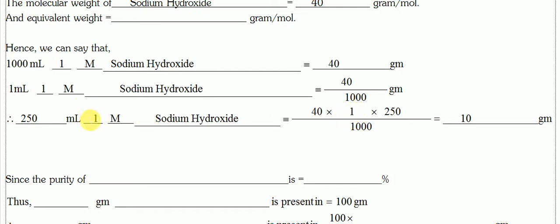If 1 molar or 1 normal is prepared, then this position is not required. If 0.1 normal or any other value other than 1 molar or 1 normal is calculated, then we will require this position. That is why this position has been placed in the formula. As in this case we are preparing just 1 molar, we do not need to write 1 here, but as the formula contains a space, to meet the need of the formula, we are writing 1 in this place, and the result is 10 gram.